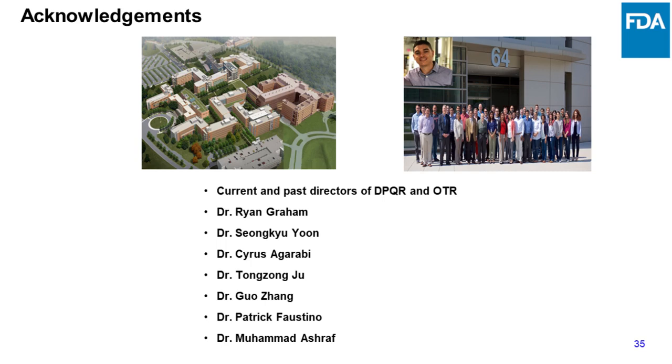Okay. And when making standards with the prepFAST, did you need to do any matrix matching or just rely on the internal standards? Yeah, it's a good question. Because it's a mass spec, I have been using the internal standard. What I have noticed is that, depending on the sample, if it is too concentrated, I see a lot of shift in my internal standard. I think at least plus or minus 20% is allowed, and I was always in that range. So I dilute accordingly so that the internal standard does not vary too much. I have only been using the internal standard, and I also tried the spike recovery, which also works. That's the way we have done it.